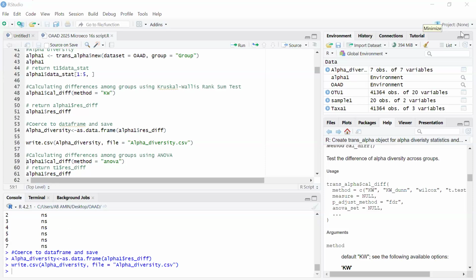From what you have done earlier, I think you have 3 data sets, right? Yes. You can share it and then the R script so that people can follow. So let me paste it into the group.